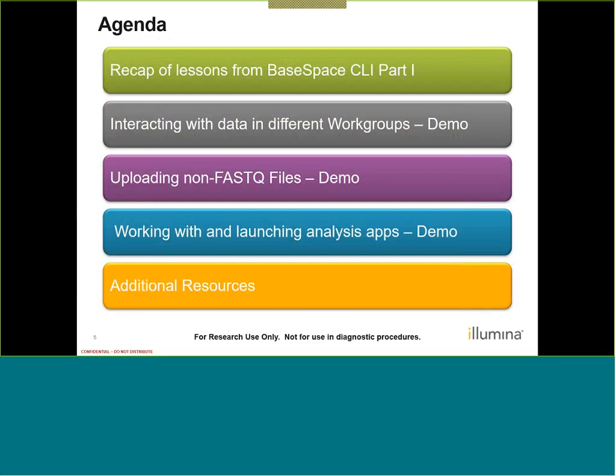So uploading FASTQ files is one thing covered in Part 1. It is possible to upload non-FASTQ files for other types of analyses and supporting files for those analyses. We'll go through that. And finally, we're going to go through an actual demo where we're launching analysis applications directly from the command line using our FASTQ files as well as our non-FASTQ files.